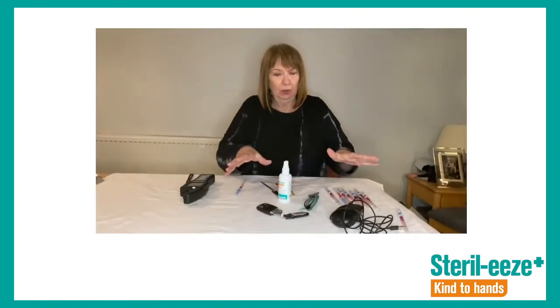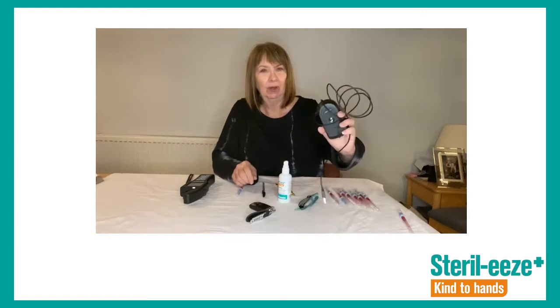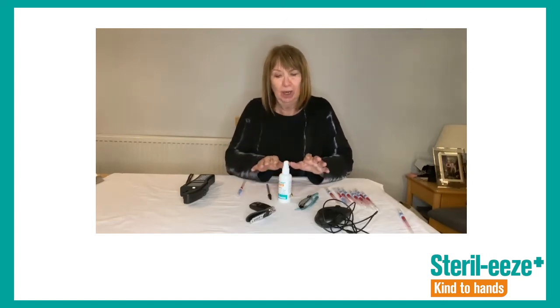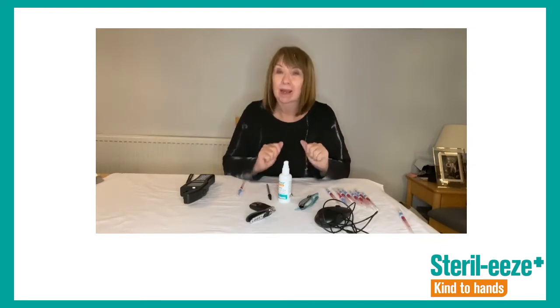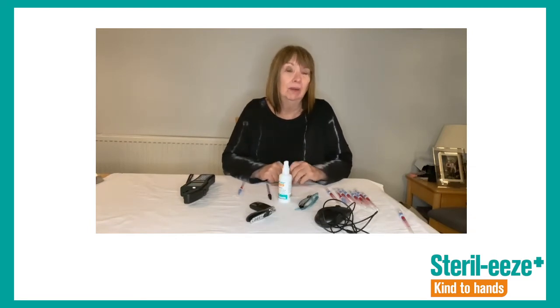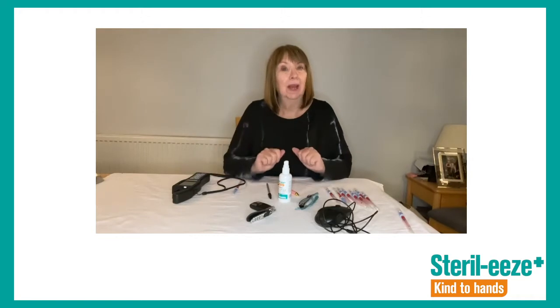Okay, so I've got a whole range of just everyday items here. I've got my key fob, my specs, a computer mouse, and a couple of pens. All I want to do is see whether or not these are clean or contaminated. I am assuming they're going to be contaminated because I cannot tell you the last time I cleaned these. So I would expect a relatively high number of microorganisms present on these items, and once I put them in this machine, I would imagine I'm going to have quite a high reading or relative light unit.